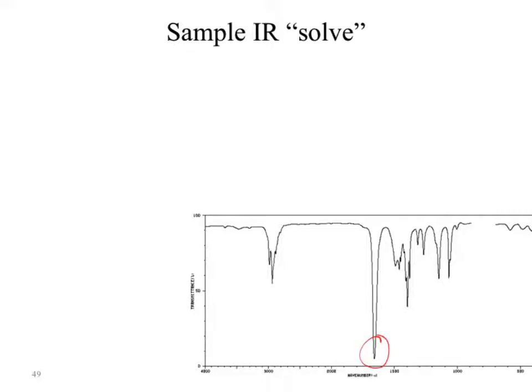Okay. I immediately see the carbonyl at 1,700. I've got some CH over here. In the previous ones, where was that distance between that peak and the baseline, or the bottom? Those things were really close, right? So I could draw a reasonable straight line, and you're like, that wasn't that big a deal. That's kind of far away.